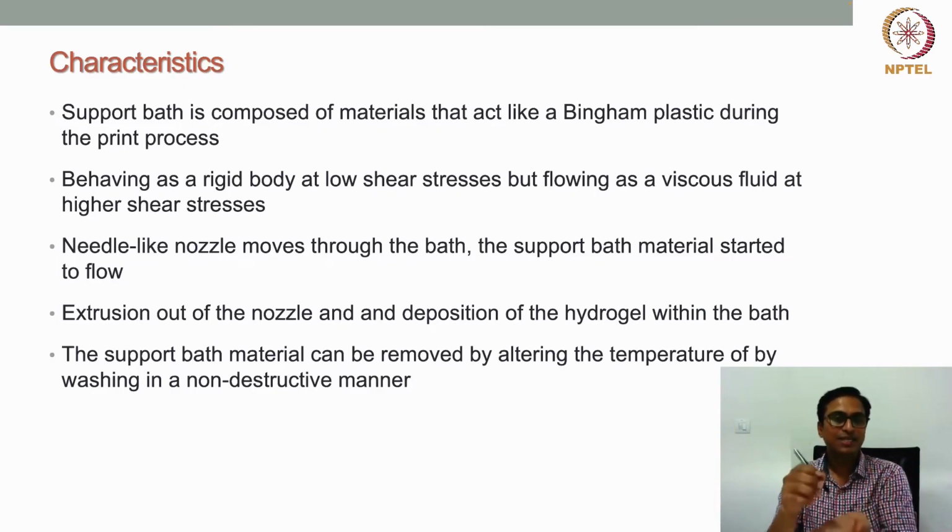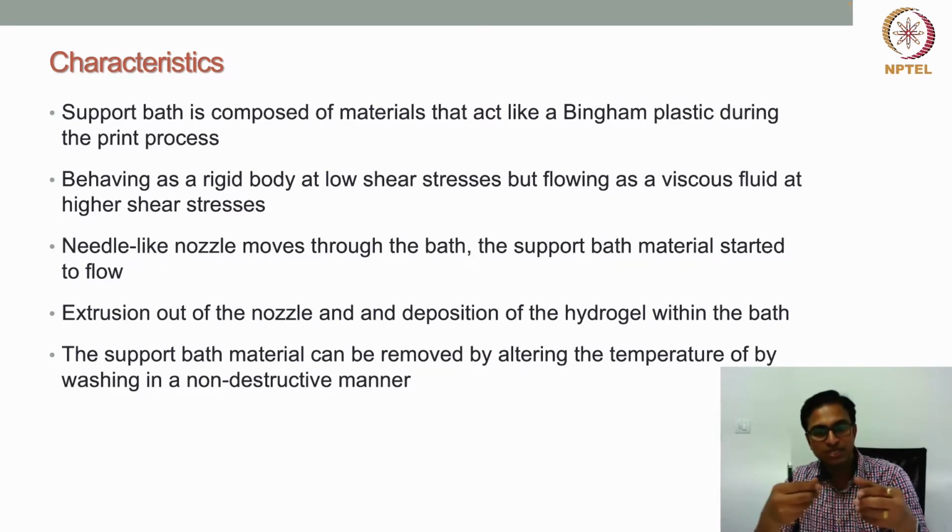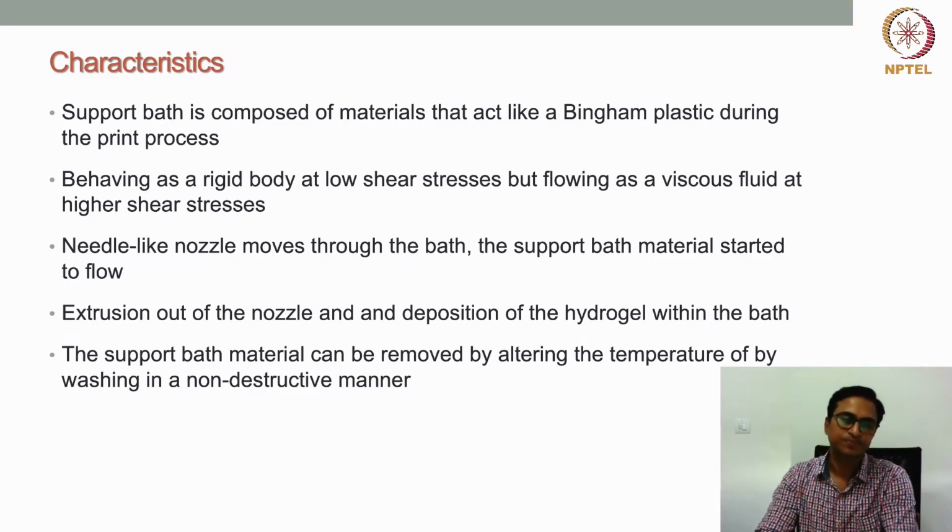Whenever we insert the nozzle and start moving it, the support bath material starts to flow. It gives space to the nozzle to move, and also gives space to the deposited material to come out. Then when the nozzle moves away, the material comes back to its original position, behaves like a solid, and provides support to the deposited material. So that is what happens in 3D printing in a support bath.